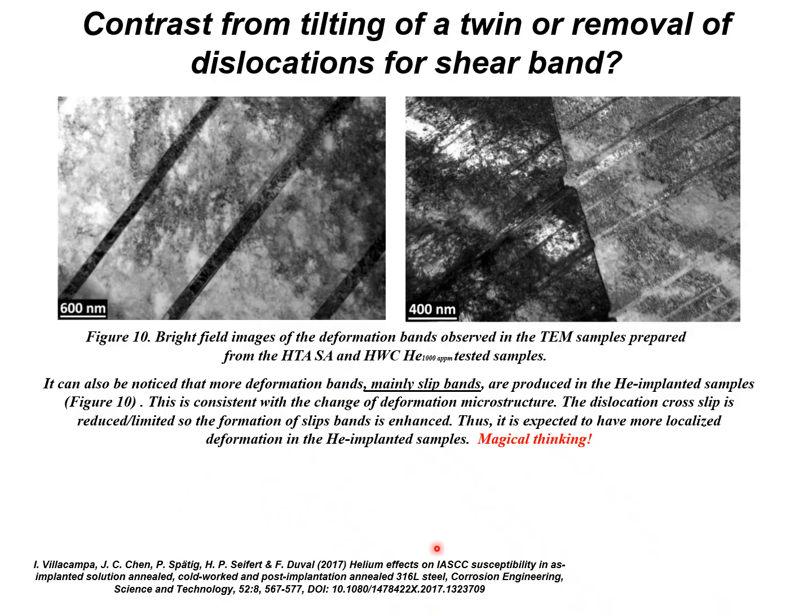I mentioned that there's confusion often, and here's another example where, to me, these are clearly either martensite plates or twins, and these authors have chosen to identify them as channels. And often people vaguely identify things as channels, whereas really there may be some channeling going on, as T.S. Bjorn and company had shown.